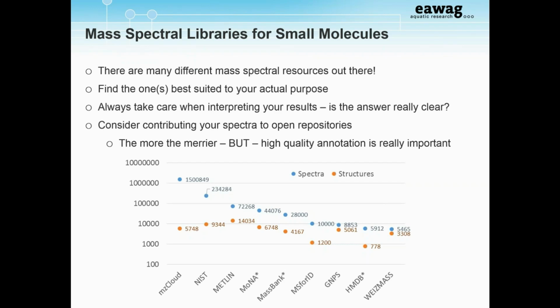We've actually found the NIST people helped us to get our MassBank spectra into NIST. They themselves do not want to accept these spectra because they're a standards institute. So instead of adding our spectra to their database, they've enabled us to get our spectra into their format and use it within the database, but they're measuring their own. Again, it really depends on what suits the different users.